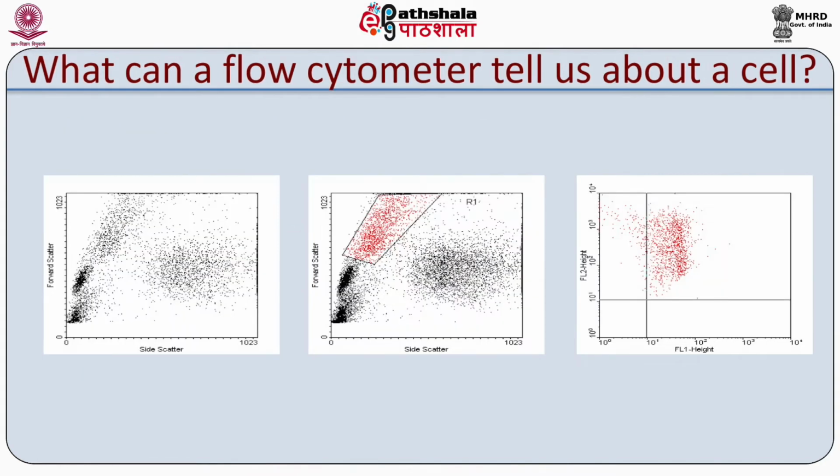Shown here is an example of how the data derived from flow cytometry looks. What you see in the plot is based on the size and granularity, the leukocyte population can be divided into lymphocytes, monocytes and neutrophils. So, the smallest population that you see in terms of the forward scatter is the lymphocyte, and the largest in size is the monocyte. The most granular are the neutrophils.